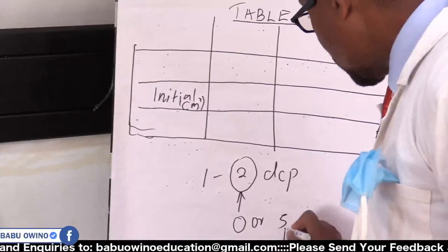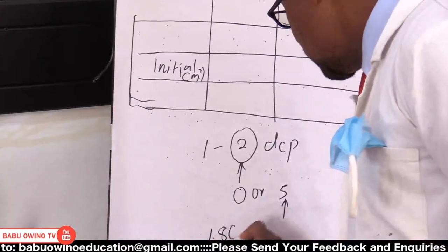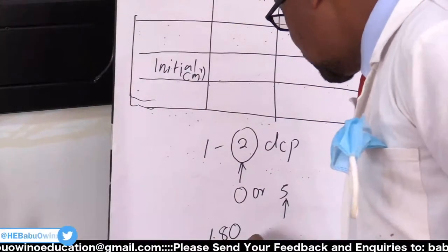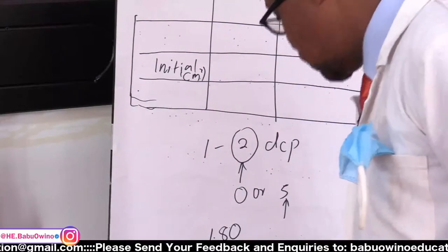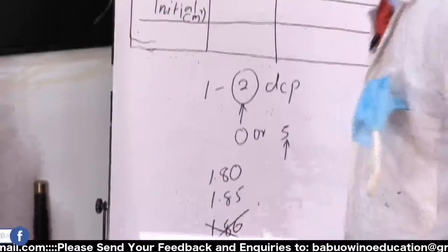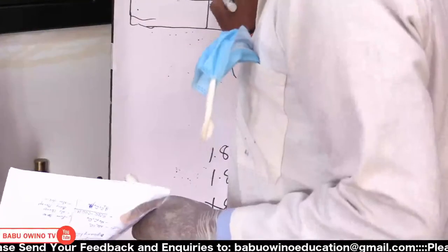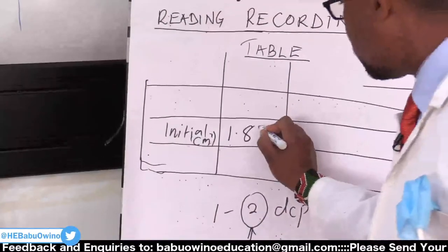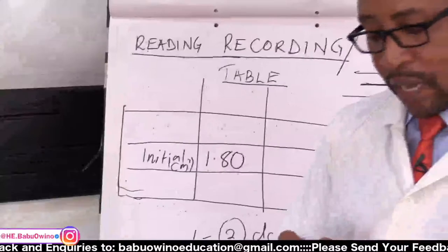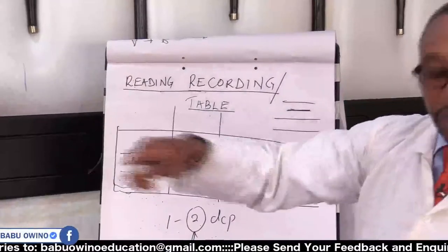If it is in the second decimal place, it should either be a 0 or a 5. It cannot be a 2 or a 3. For instance, we can talk of 1.80, 1.85, but we cannot have 1.86. This will be wrong. So in my initial, before he even starts, I indicate here 1.8. You can have one decimal place, but in my case, allow me to use 1.80. Then we allow him to run the titration.